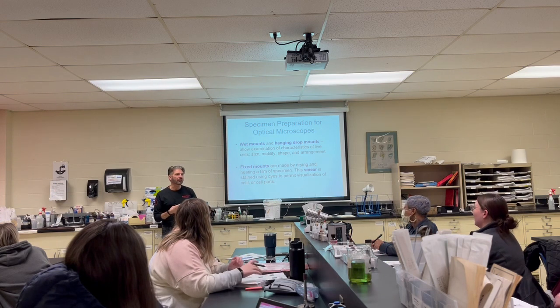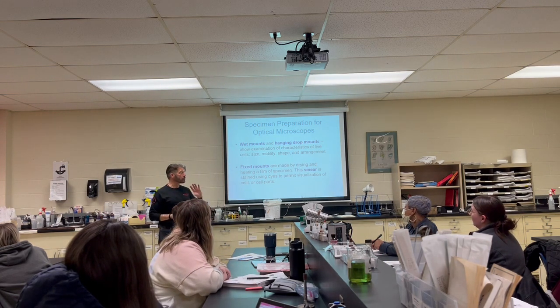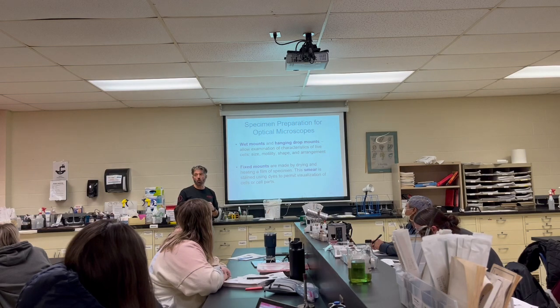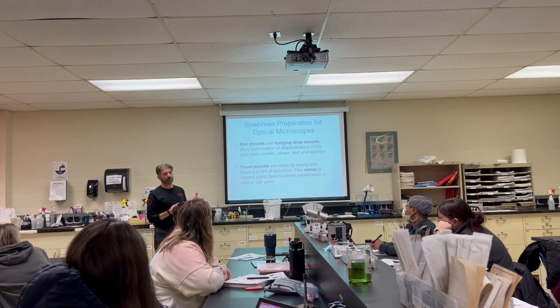So for us, we're going to stain it today with a simple stain. A simple stain means we're just going to stain it blue or pink or purple, just to stain. Next week, we're going to gram stain. We'll differentiate between gram positive and gram negative. I'll go over that today, time permitting, so you know what that is. That's really going to help you determine the structure of the bacteria.